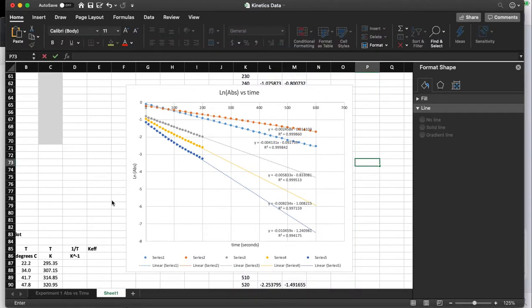All right, so we're going to move into the third part of this particular experiment and describe what it's really going to be asking you to look at and do. And this one's not quite as cut and paste as far as just being able to generate plots with data that's given to us.